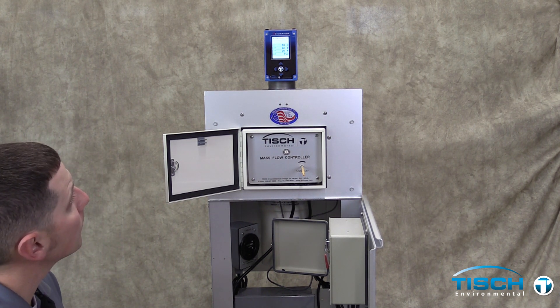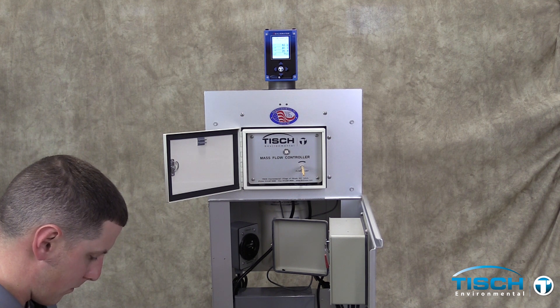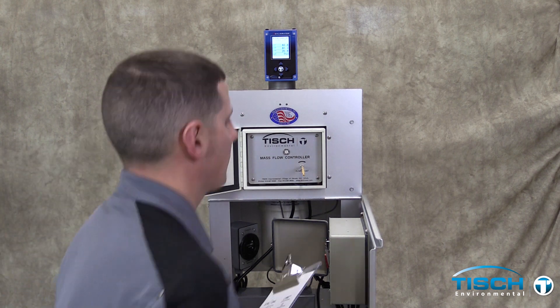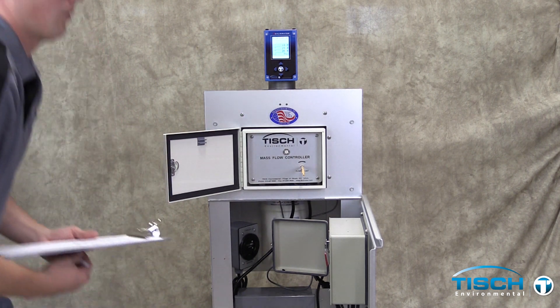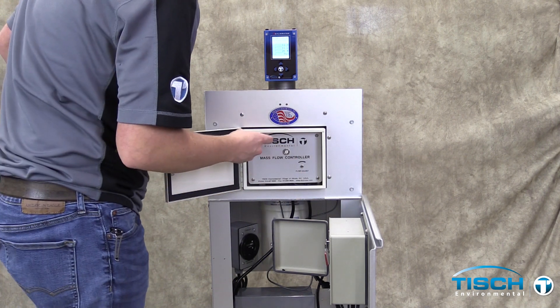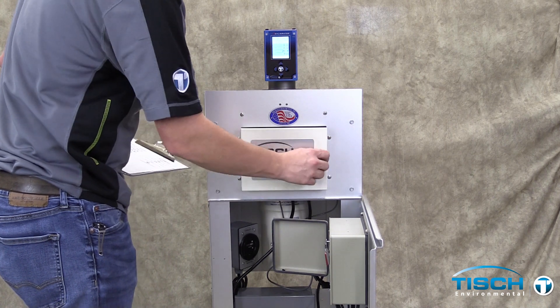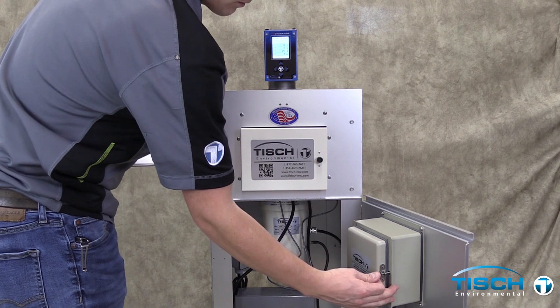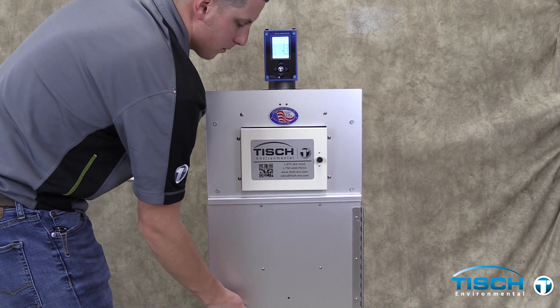Record the temperature and pressure from the calibrator. Turn the system off and close up the shelter. Turn off the calibrator.